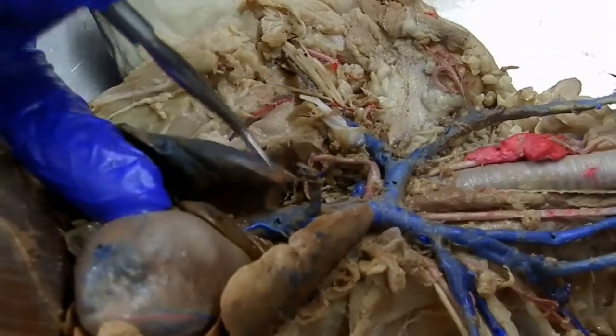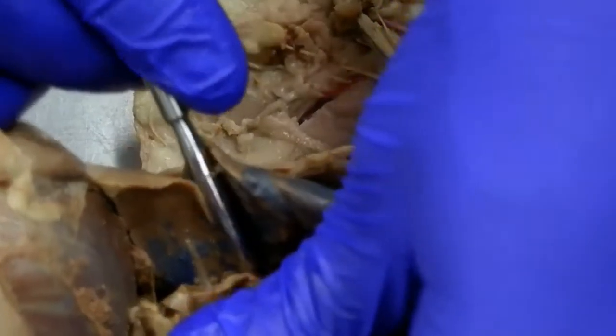That is the superior vena cava — the first branch coming off the bottom. Moving stuff around, there is the azygous vein. So that's the azygous; superior vena cava, there's the azygous.